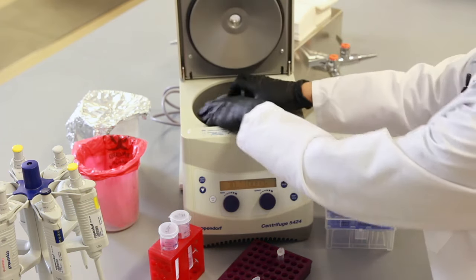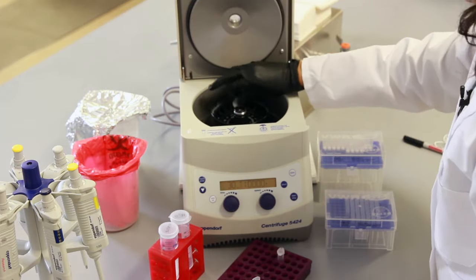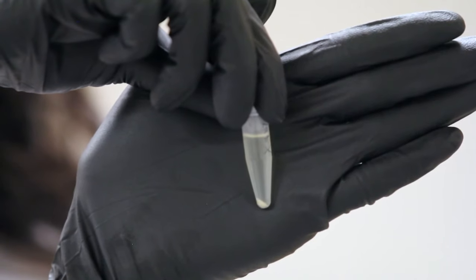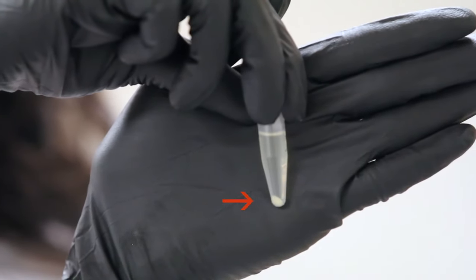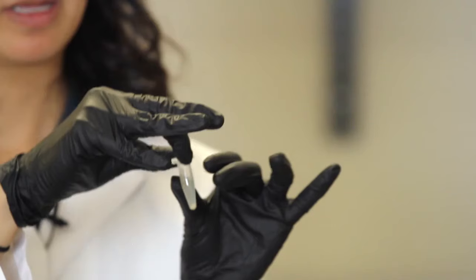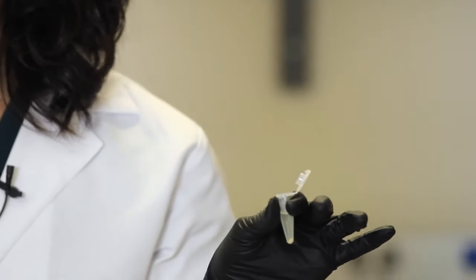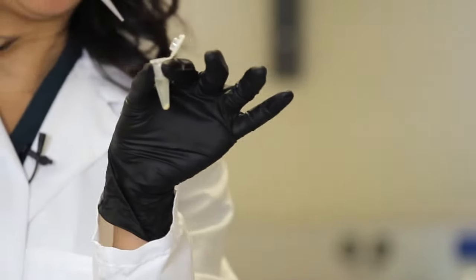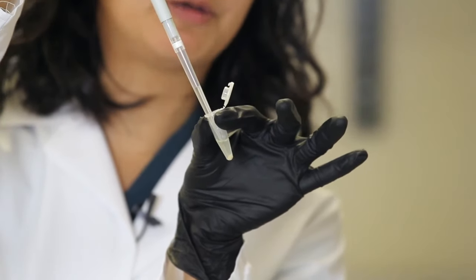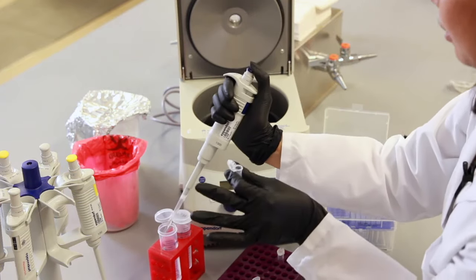When my spin is done, I can unscrew my lid again. And I can see here, and you might be able to see the contrast better against the black gloves, where I created a pellet of the bacterial cells at the bottom, with the liquid supernatant on the top. I don't want the supernatant for the purposes of my experiment, so what I can do is take a pipette tip and be very careful about removing the supernatant just from the top without disturbing the pellet at the bottom. I'll put the supernatant into my waste tube over here.